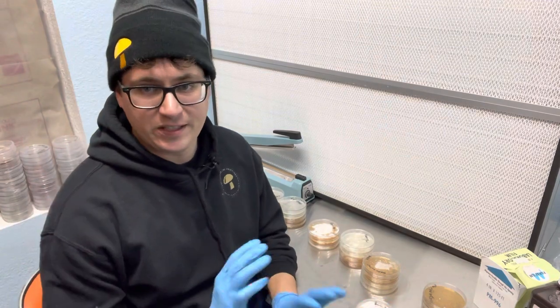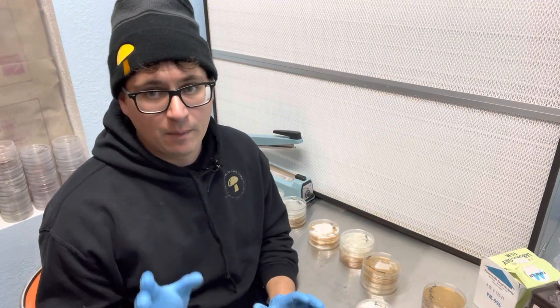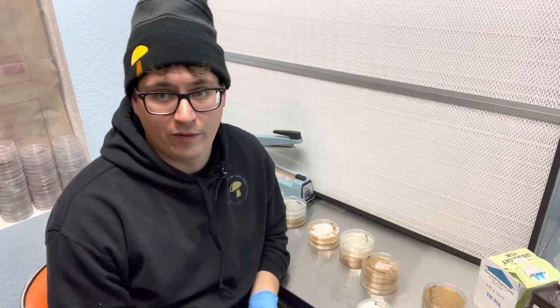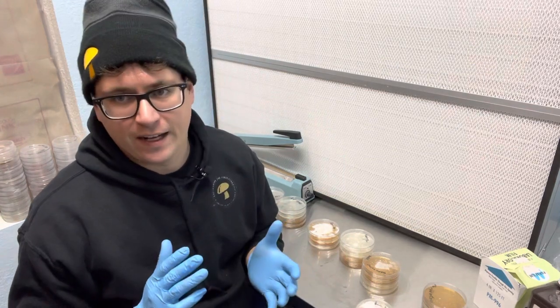What's up guys, it's Gary with Fresh from the Farm Fungi. I'm here in Denver, Colorado, and I'm 16 days into my breeding project for 2022. I wanted to go over some important factors of why you should always be observing your plates.